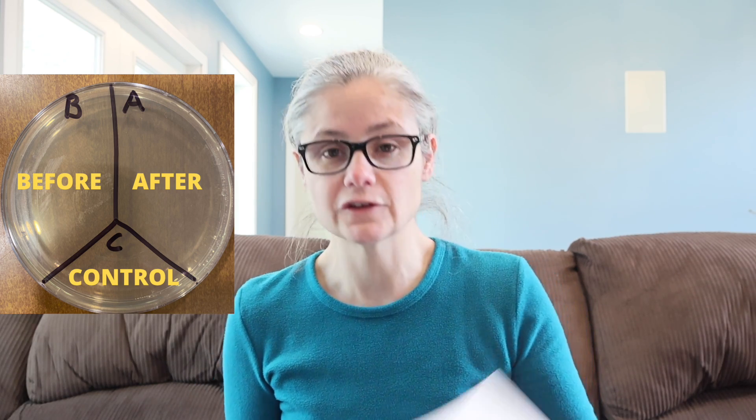In order to test whether Sal Suds can remove bacteria, I'm going to take a petri dish and label it A, B, and C. I'm going to take some sterile swabs and swab various areas around my home — my kitchen sink, kitchen sink drain, bathroom sink, toilet rim — and place those samples in the section labeled B for before. Then I'm going to clean according to the dilution sheet from Sal Suds' website, swab the area again, and place the sample in the section labeled A for after. C is my control — nothing's going to go there.